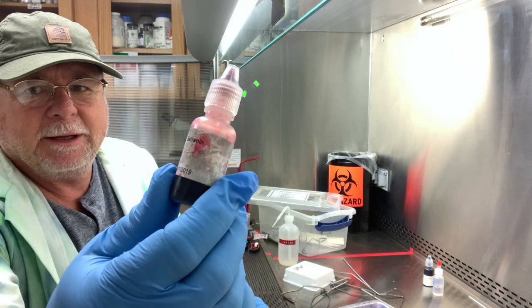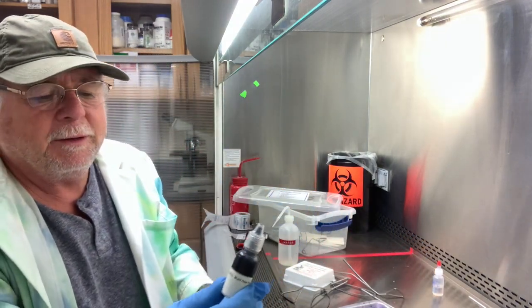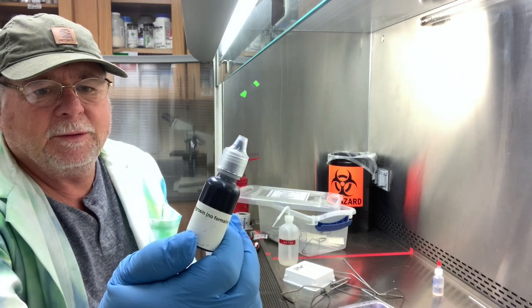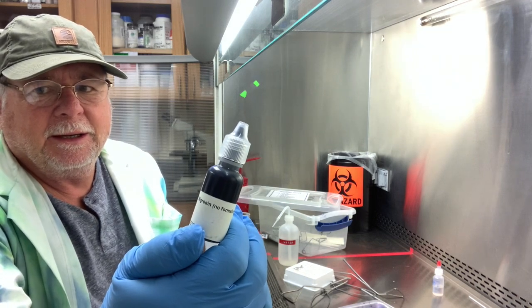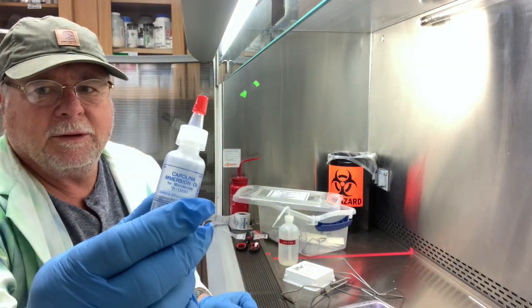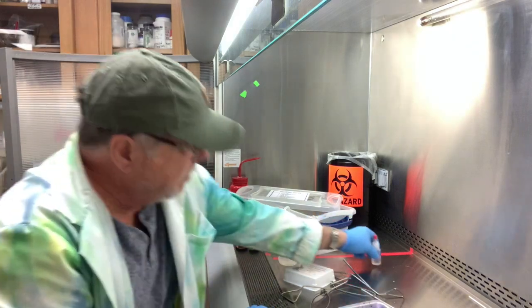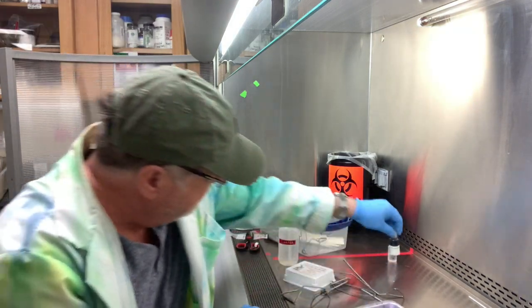Here's safranin. It's a pink stain. Here's a totally different stain for later in the procedure. We'll do a negative stain. And then here is the oil to go on your microscope lens. Okay. And so all those are in your kit.